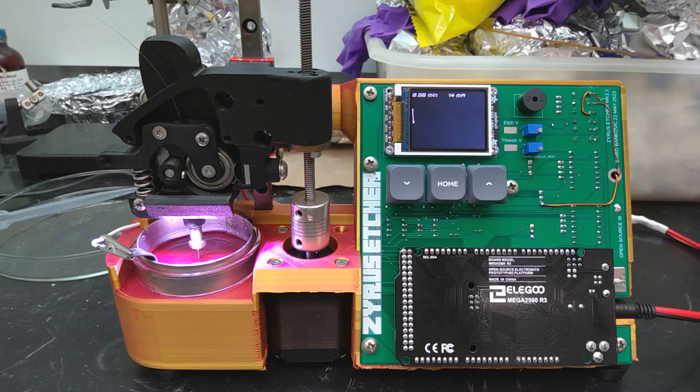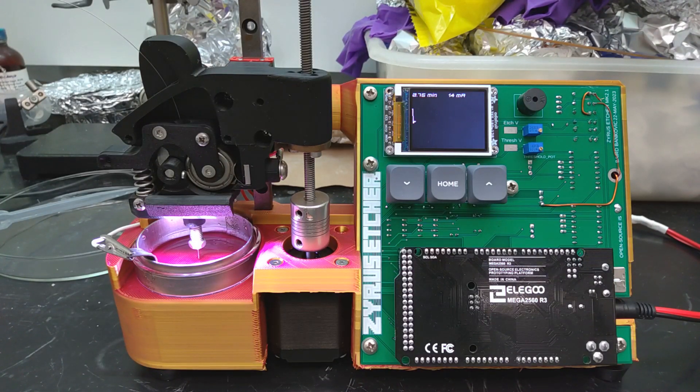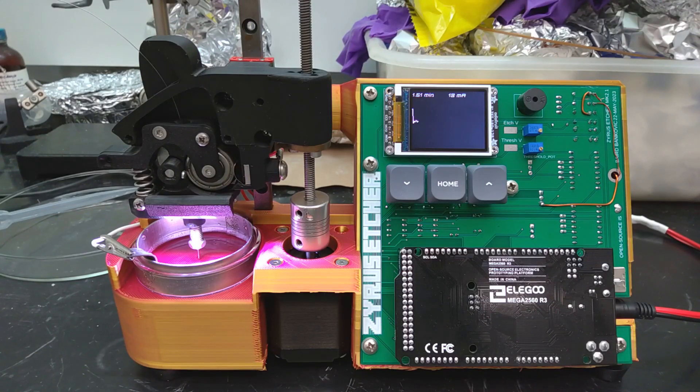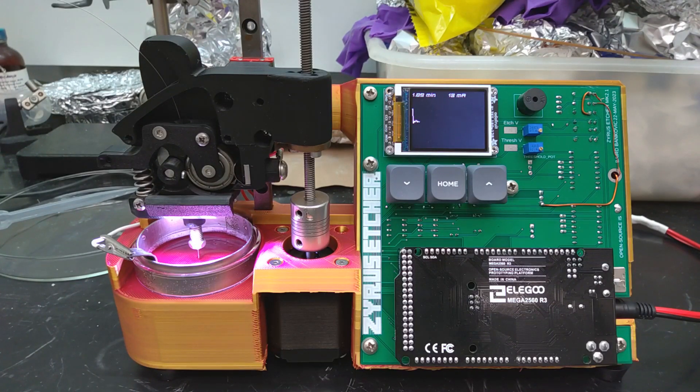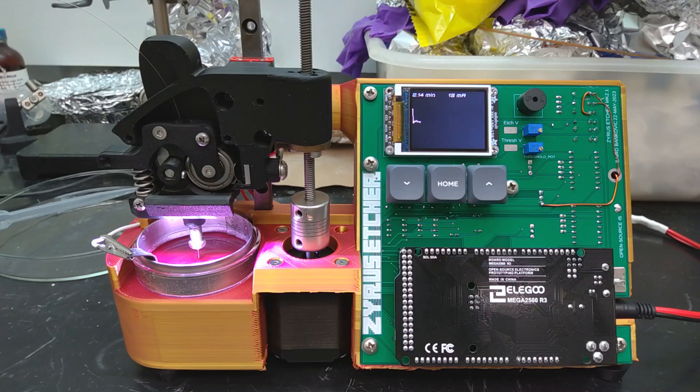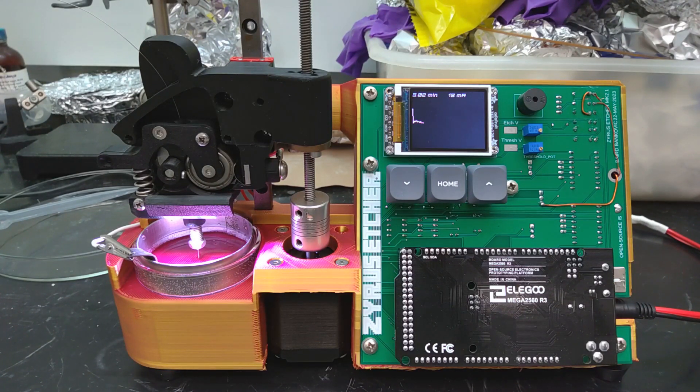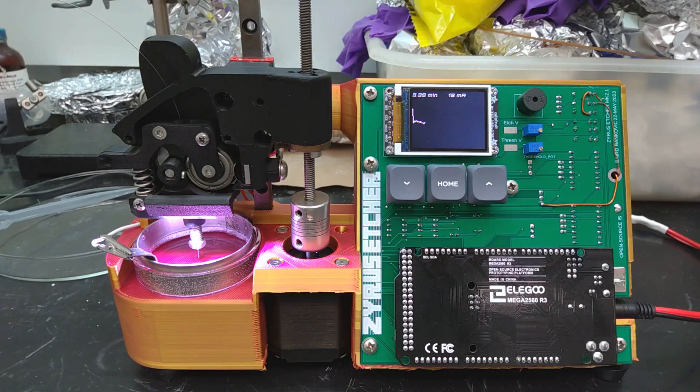Hydrogen gas forms at the stainless steel ring. It is important that the gas bubbles do not come near the tip during etching, as this will cause asymmetries, resulting in inconsistent tip geometry. Because of this, the stainless steel ring is more than an inch away from the tip.